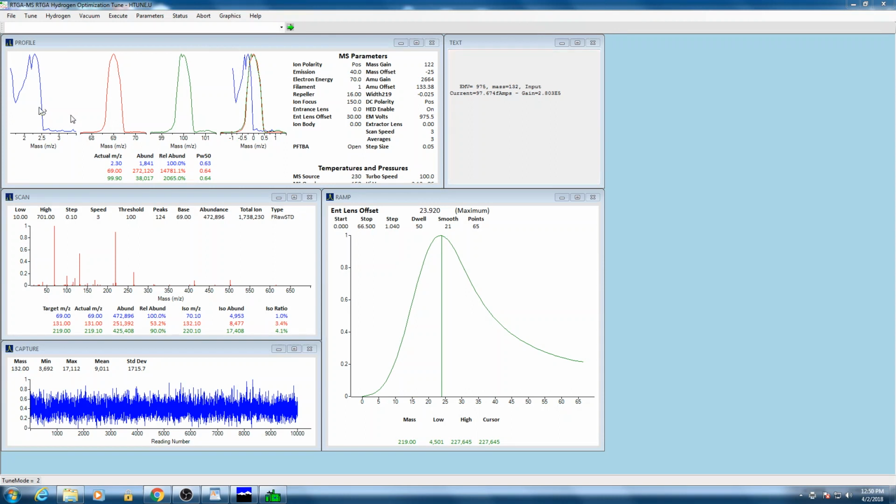You can see here, this low mass peak has changed to 2 AMU, so that's sampling for hydrogen, or measuring for hydrogen. But if you look closely, every now and then you'll get this peak that is basically at 0. And this is sort of an intrinsic issue with trying to measure hydrogen through mass spec. From my understanding, this is called a zero blast measurement issue, where essentially the hydrogen molecule is so light that sometimes the detector thinks it's just noise.